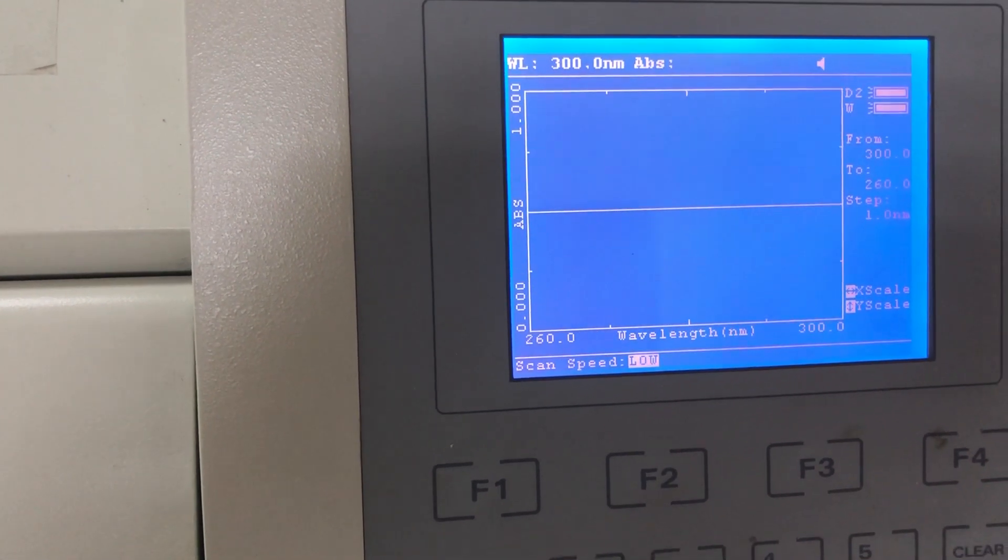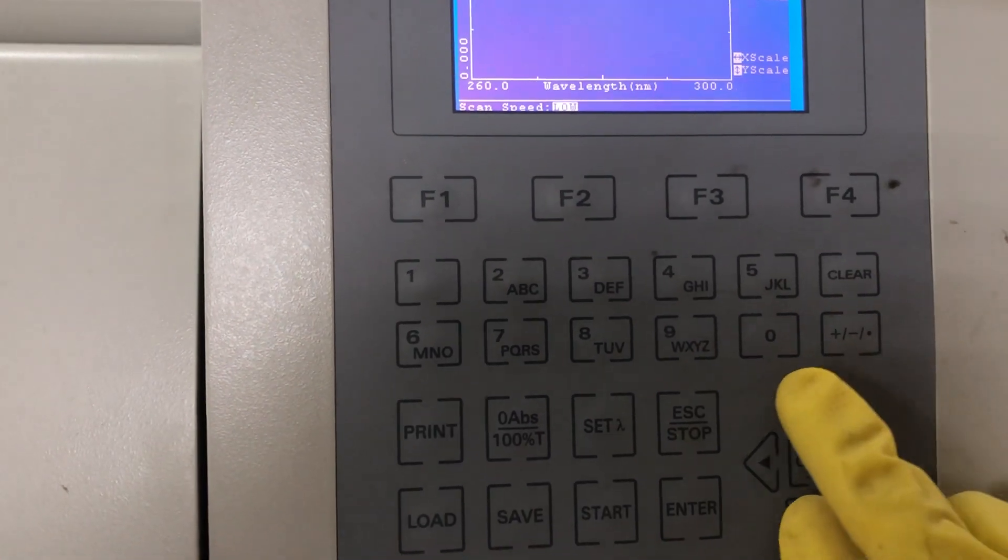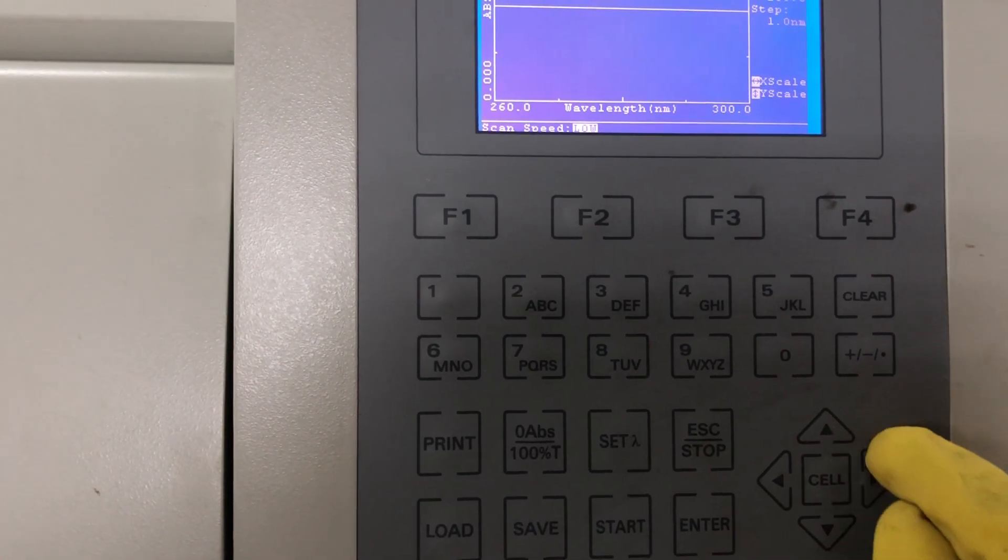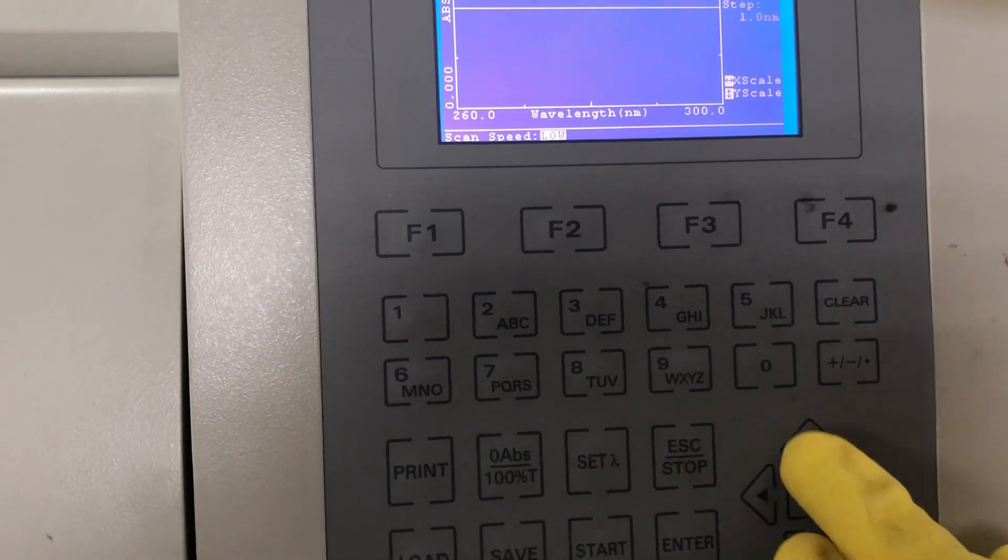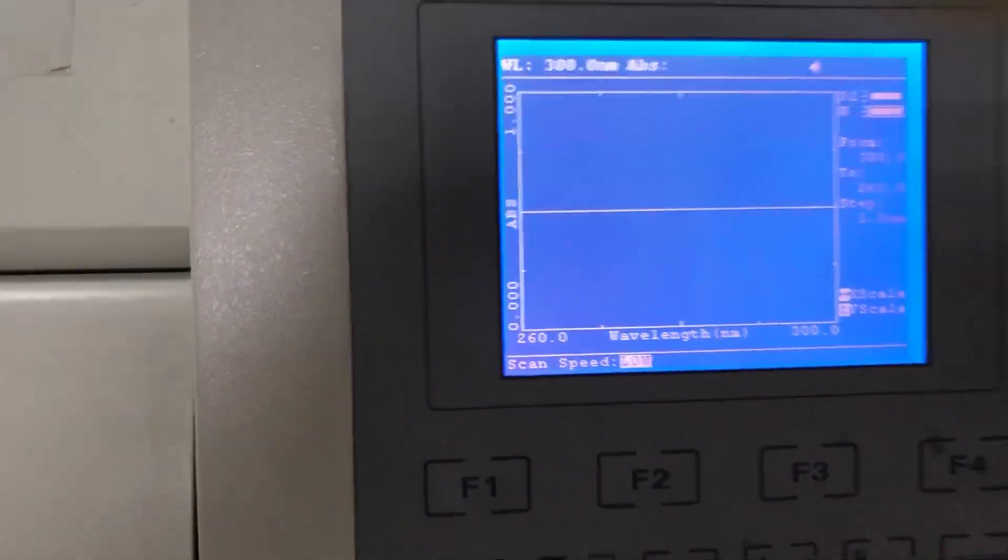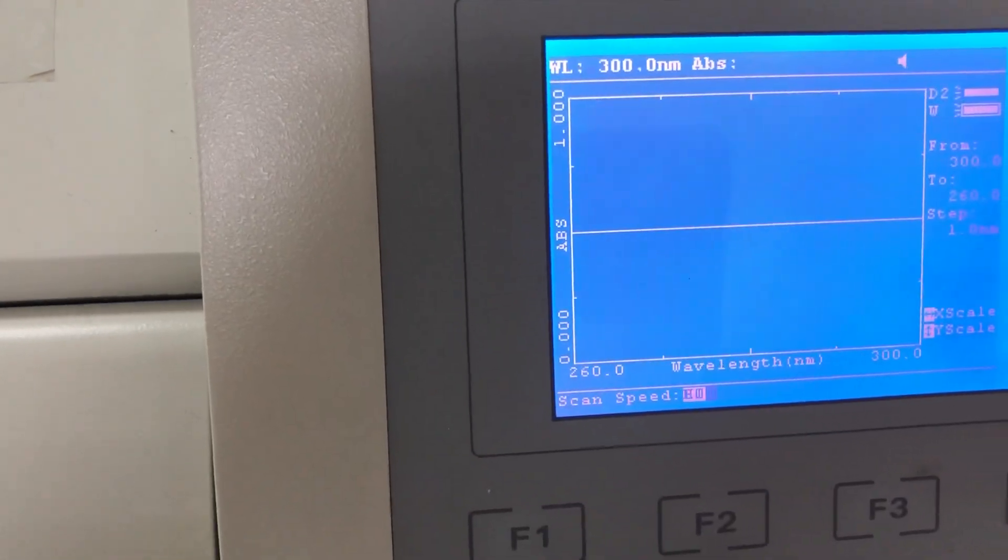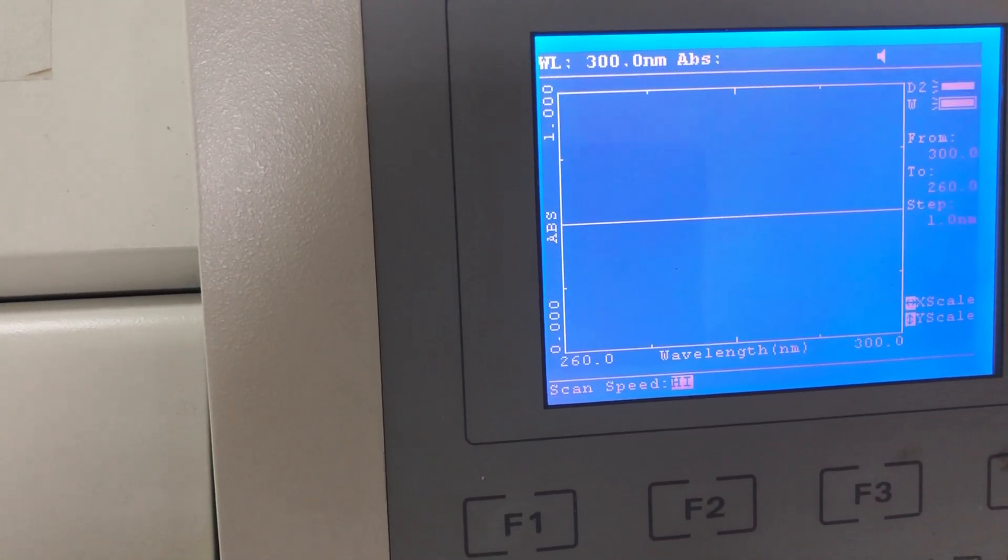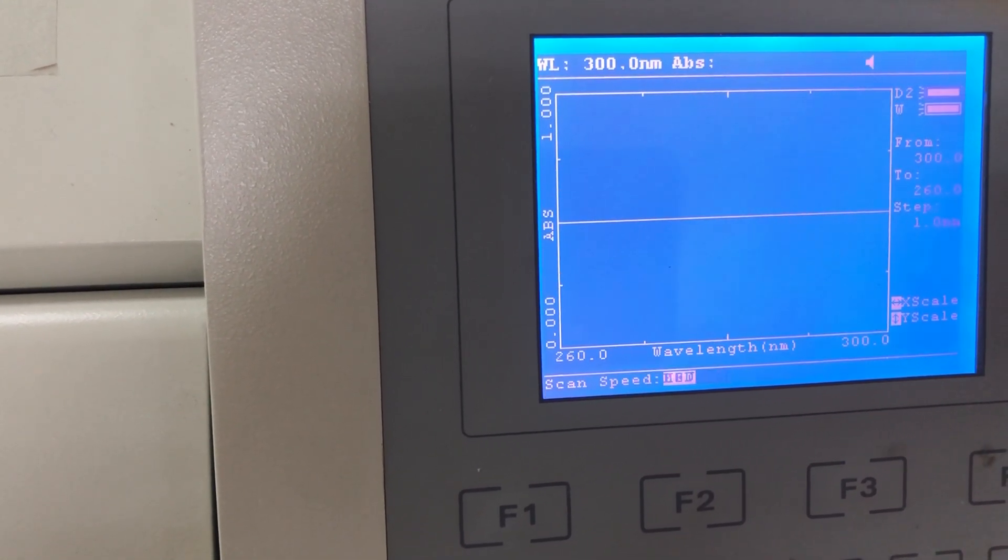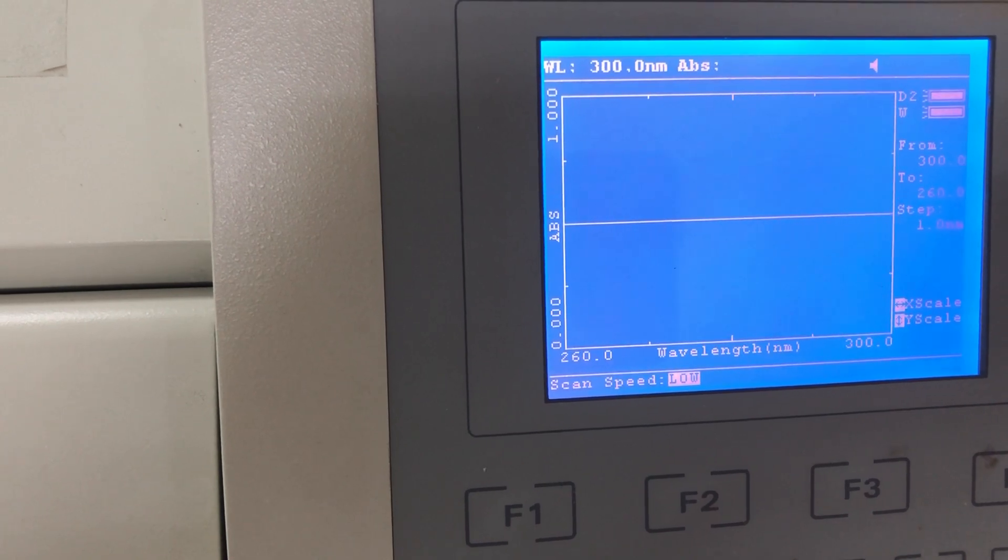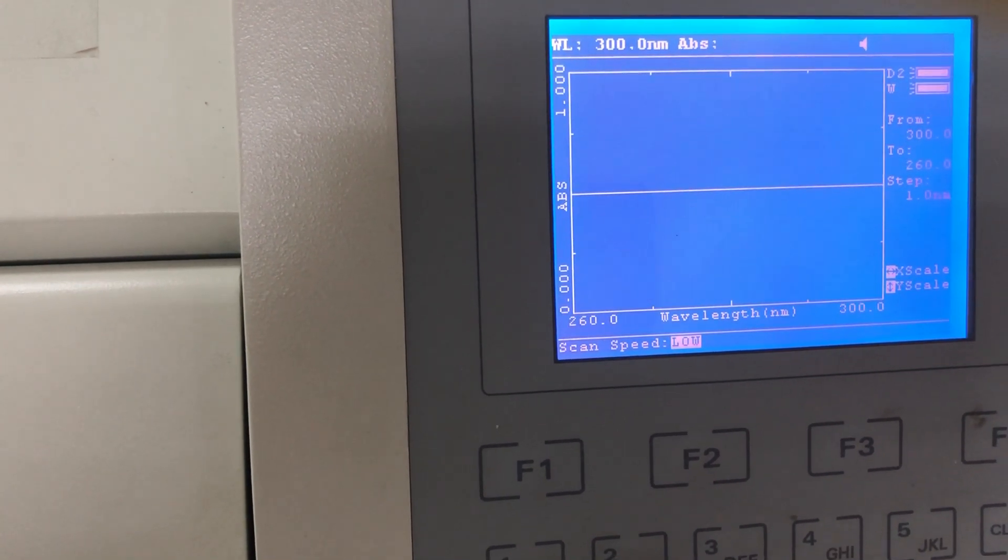Scan speed, you can also change the scan speed from low to high using the up and down arrows: high, medium, low, and press enter.